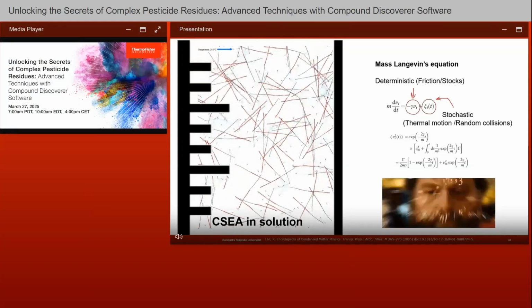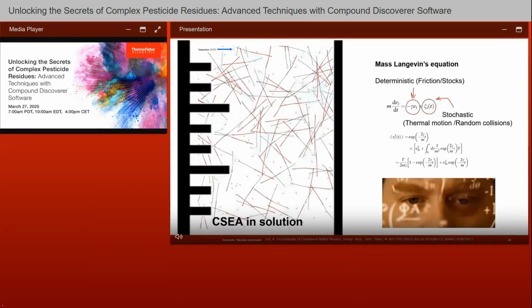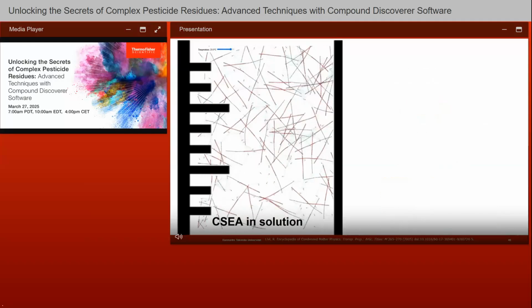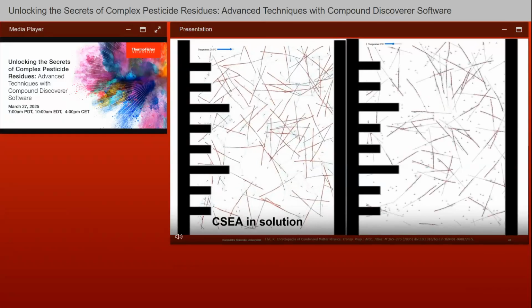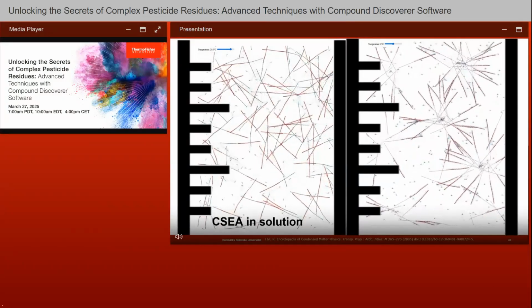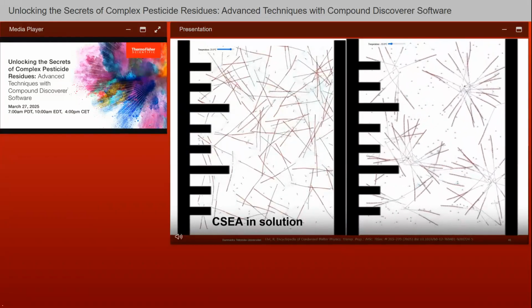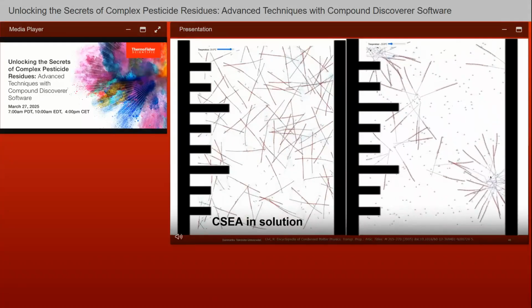The take-home message is that the stochastic term also includes the time and temperature, which arguably leads to the formation of, for instance, micelles, which can be flocculating out of the bulk solution. When we drop the temperature to about -20, they are out of the solution, and it will affect our recoveries then.